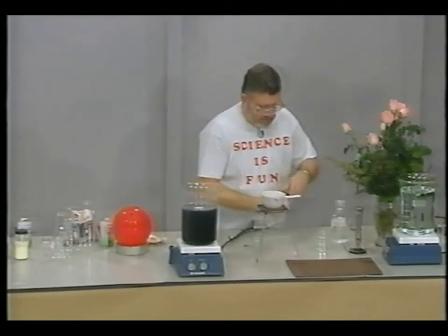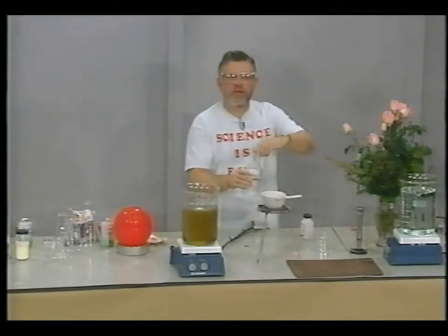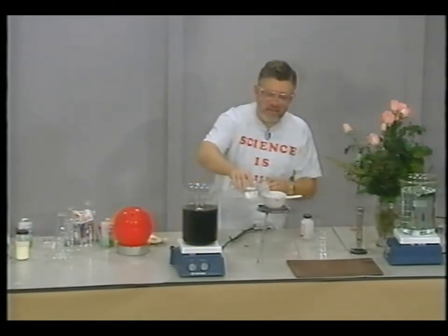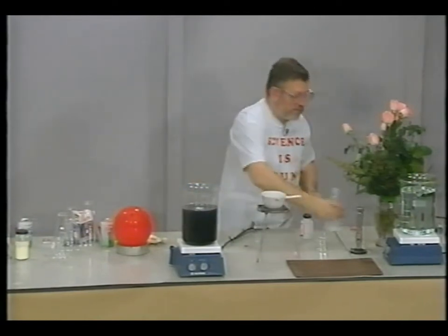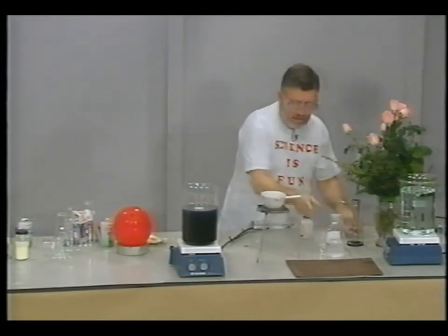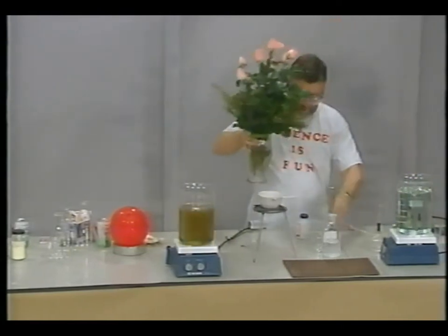Just have some zinc metal there. Then I'm going to add a solution of what we call zinc chloride. So here's the zinc chloride solution. So we have zinc, the copper pennies, and the zinc chloride solution. And I'm going to heat this mixture.